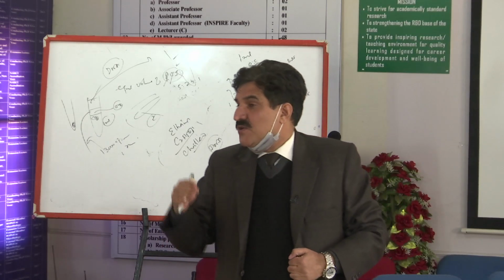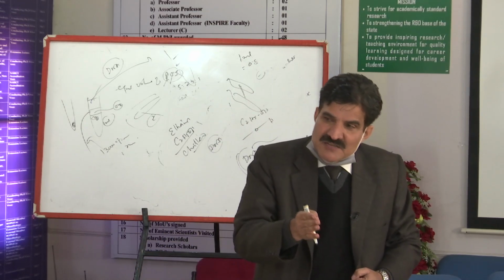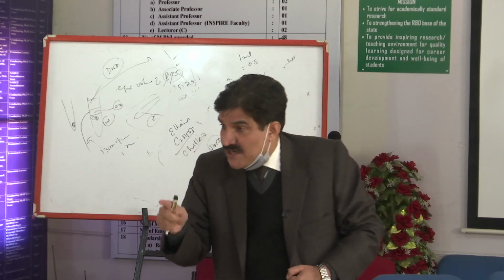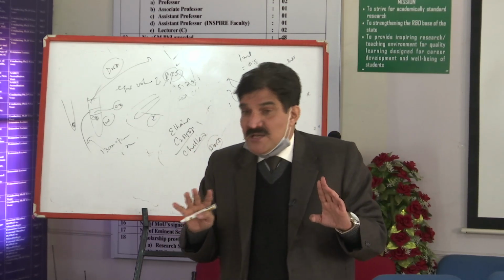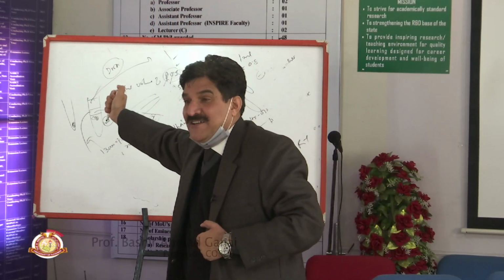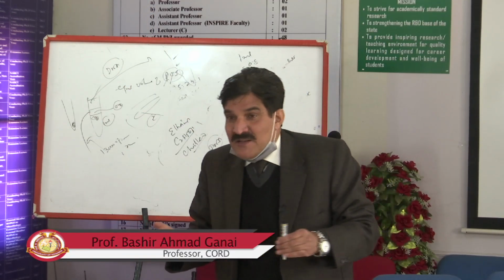Or you allow it to precipitate out, then you centrifuge it at 13,000 or 10,000 RPM for 10 minutes. Precipitate will settle down. That will be DNA. Maybe some other molecules sometimes, not 100% I can say, but DNA will be there. If you are taking only by the tip, that will be only DNA. But if you precipitate it out, it will be at the bottom, that will be DNA.